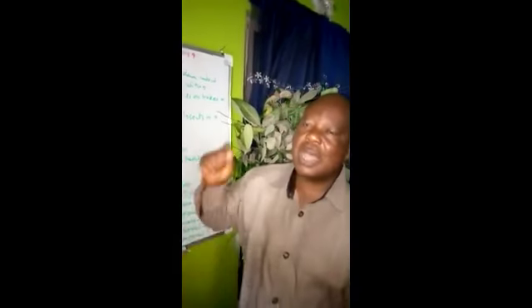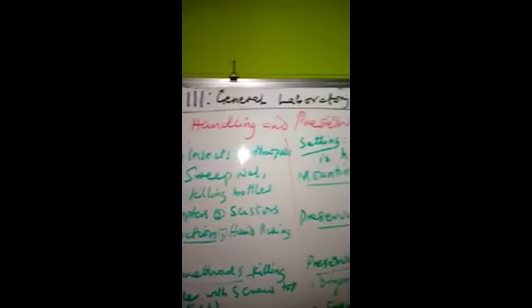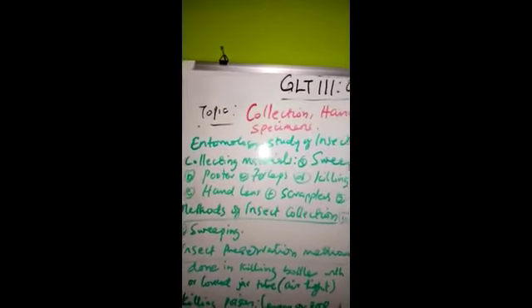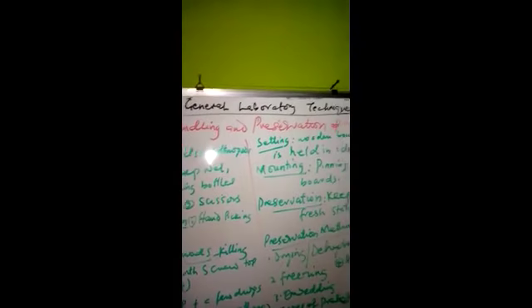We are continuing our discussion of the subject General Laboratory Techniques, coded GLT. And today we are looking at part 9 of that lecture. The topic for discussion today is collection, handling, and preservation of specimens.